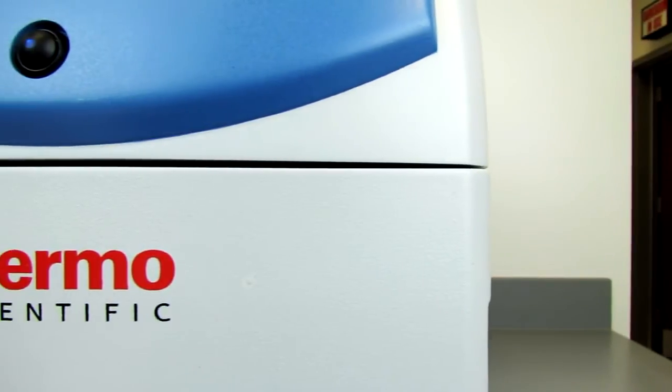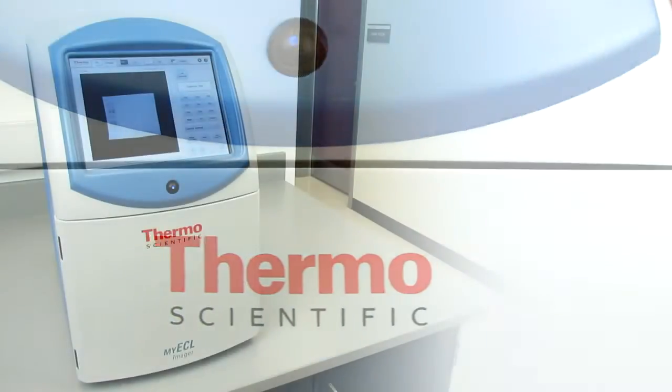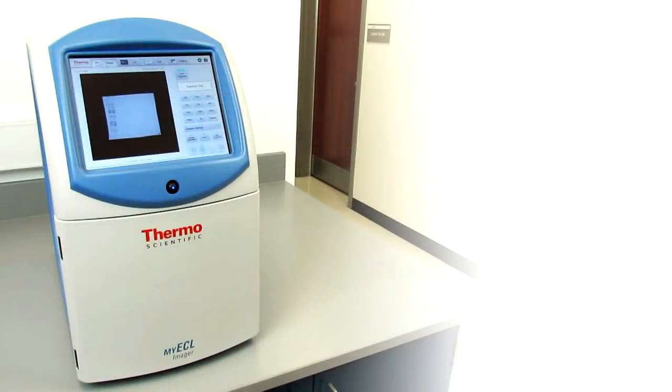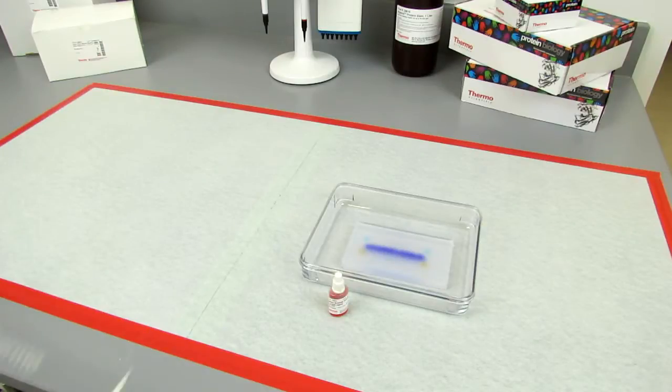The Thermo MyECL Imager is a standalone platform for one-touch imaging of polyacrylamide gels and Western blots for protein detection and agarose gels for nucleic acid detection. Let's look at using the UV mode to capture images of nucleic acids and agarose gels.